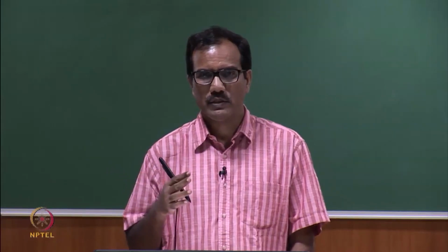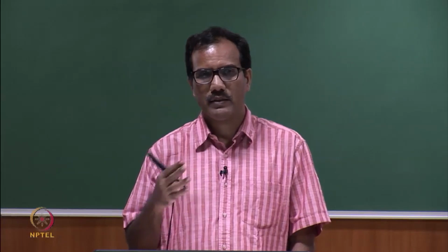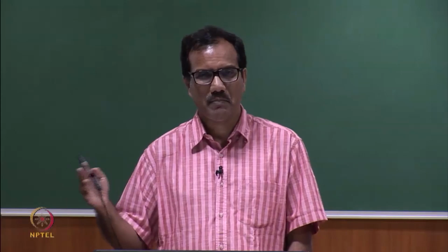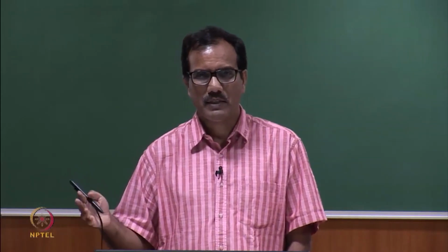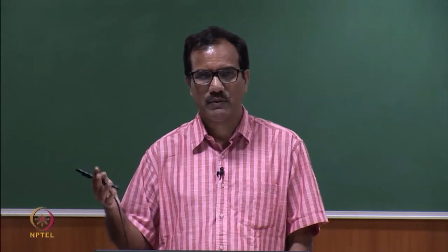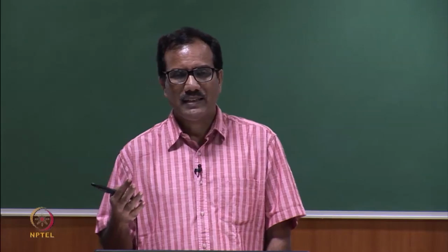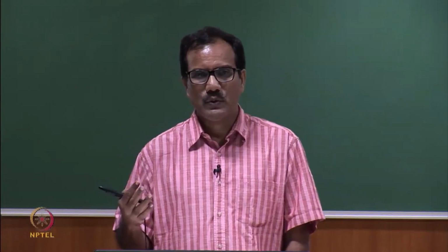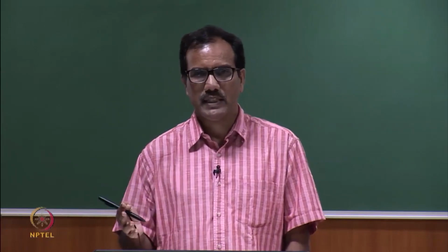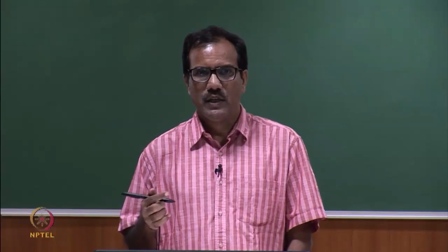I also discussed about getting information from FRET using lifetime measurement, and that can be utilized to understand the interaction between two different molecules. We can also do microscopy using these techniques, but I will discuss microscopy in the next lecture.